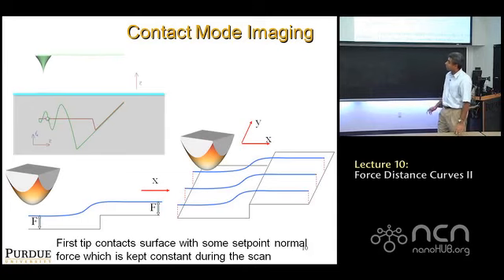But again, I hope you realize that understanding FZ, FD is essential to choosing the appropriate force at which you do it. Let's say you apply a very large force where you're beyond the yield point of the material. Then you're getting information, but you're not sure what you're doing because you're really yielding the material underneath the tip.